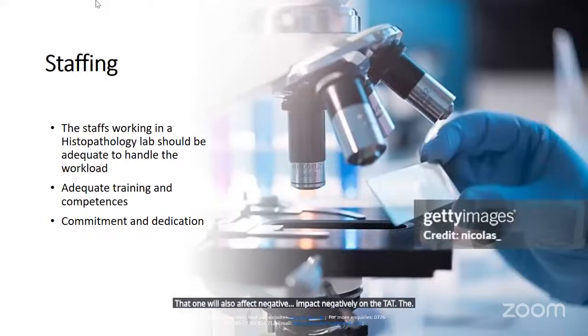The team, both pathologists, the technologists, the typists, the health records officers, should be dedicated and committed to work together for the better, for them to release the patient's results within the specified period of time. If you are not committed, of course, there will be delays, and that will affect our TAT.